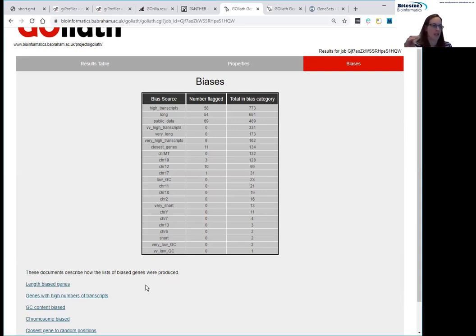So at the moment that threshold is fairly arbitrary and can be subject to moving around really, but as with all of this, it's pretty difficult to set thresholds in this. But yeah, these documents, I'll go through those a bit more.